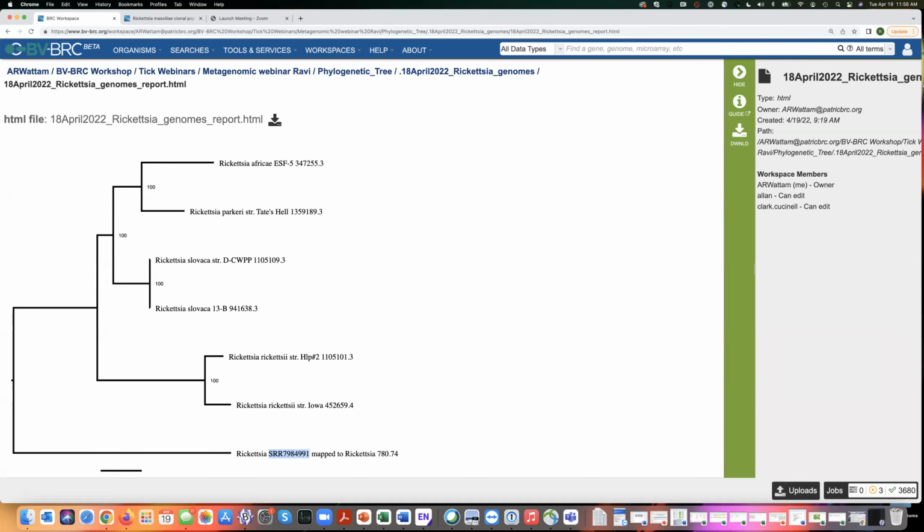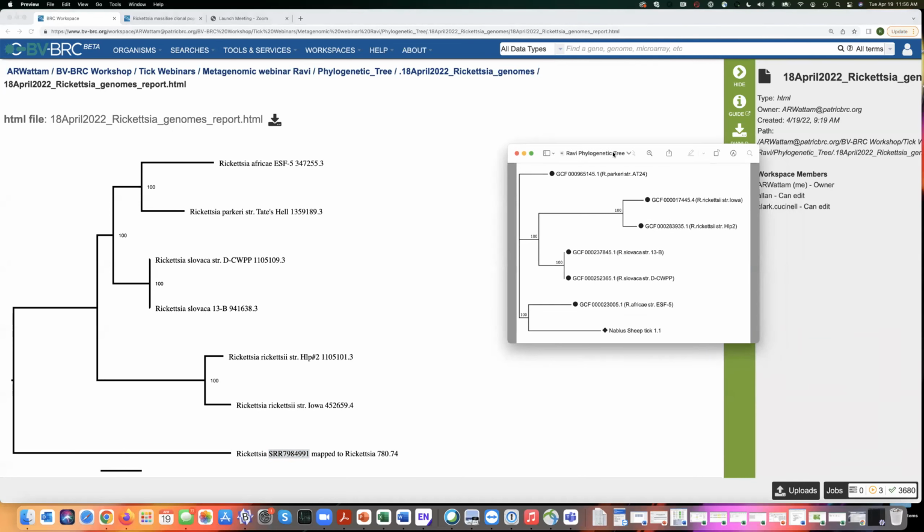Now, there are a few more questions. Sorry to keep interrupting, but I just want to make sure we don't go too far. Sure. So there was a question from Kingsley, I'm just going to read it off directly. He was saying, I was expecting the accession numbers as part of the data pulled up to be the same data, especially when you select exact terms. So why weren't they? Oh, why did I use different accession numbers?